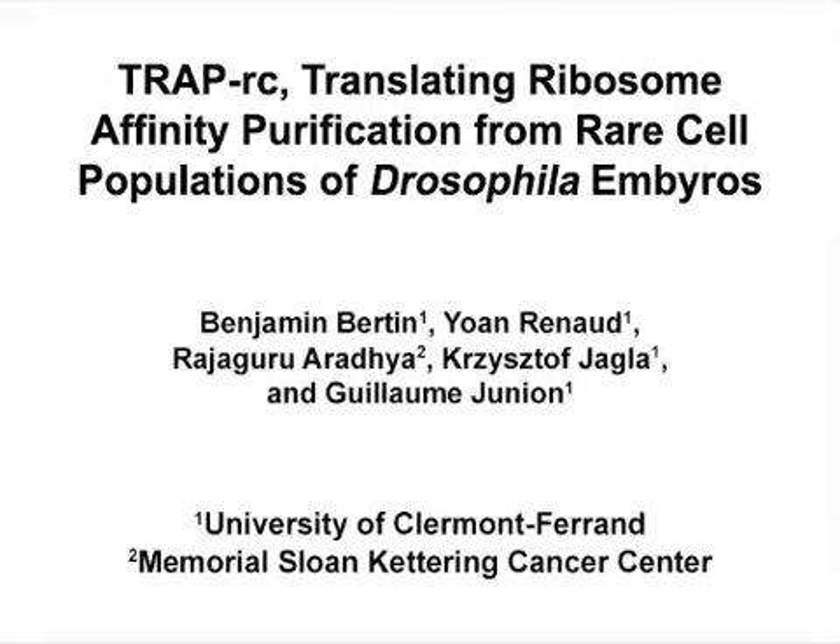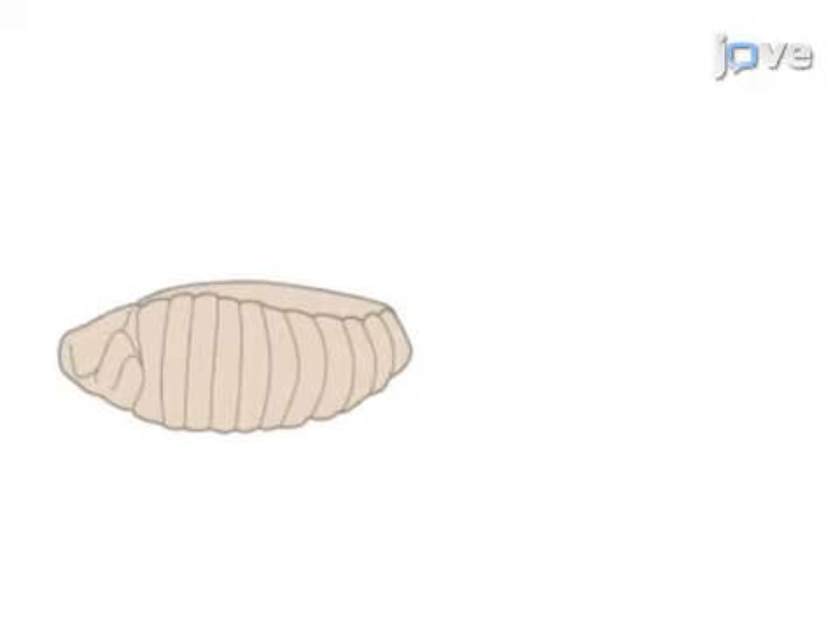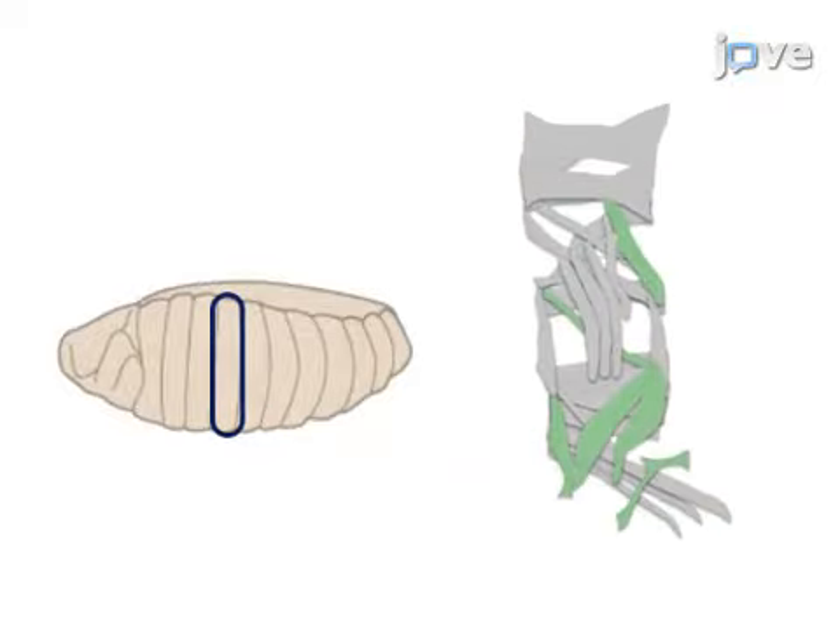The overall goal of this procedure is to isolate engaged-in-translation RNA in a cell-type-specific manner in Drosophila embryos. This is accomplished by first collecting embryos from a transgenic fly line, allowing specific expression of a GFP-tagged ribosomal subunit in the targeted cell type, in this case the slouch muscle cells.